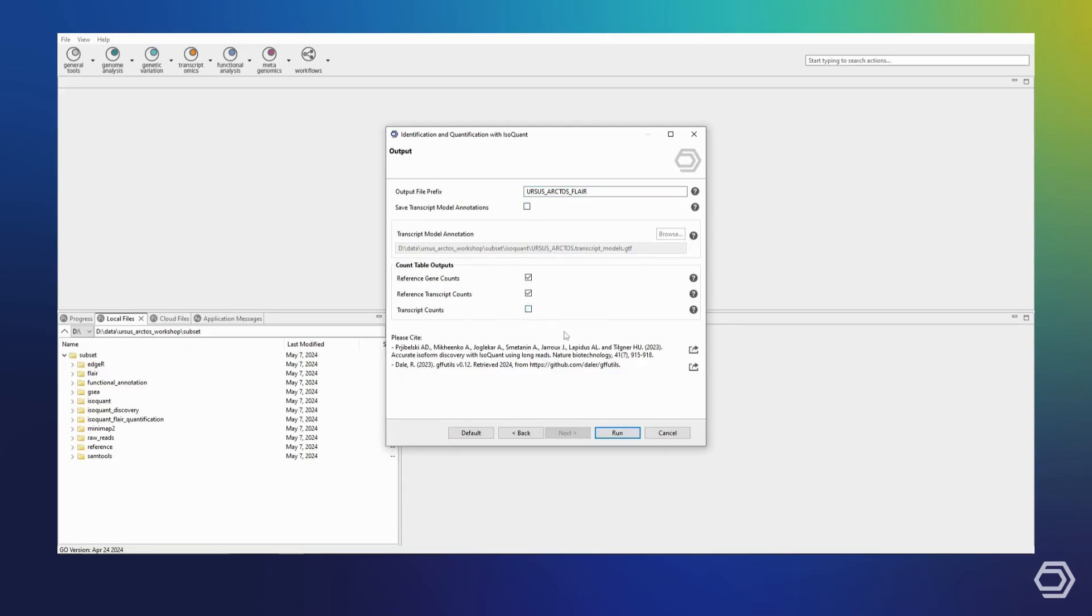What this actually does is that it lets OmicsBox know that we can skip the isoform identification step of IsoQuant and only perform the reference-based quantification. This lets us save some time as well as computational resources.